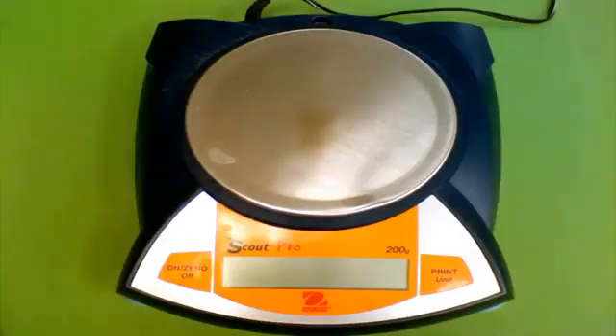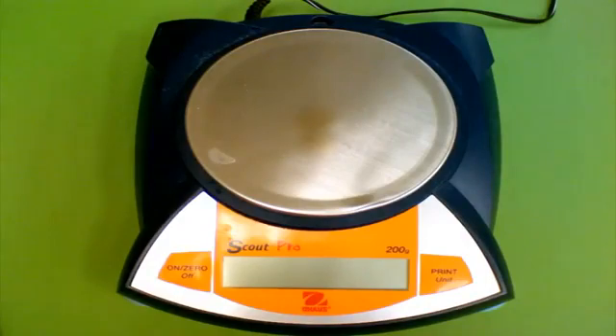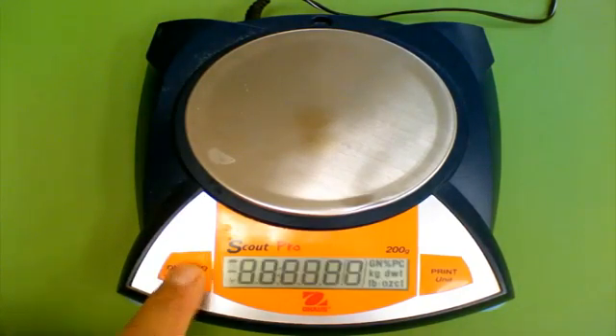Using the electronic balance is quite simple. You need to first make sure the balance is on a level surface. In order to turn the balance on, press the on/off switch and give the balance a chance to warm up.